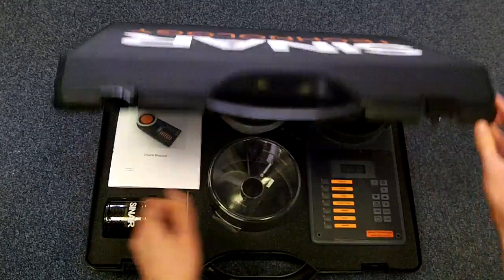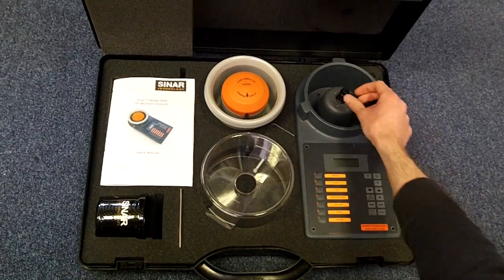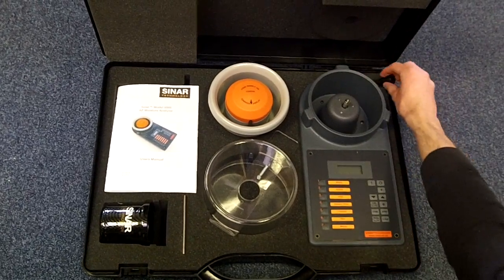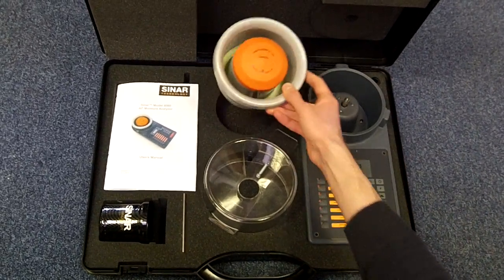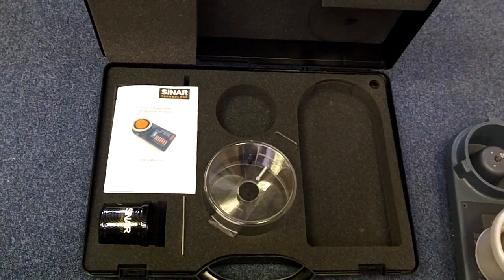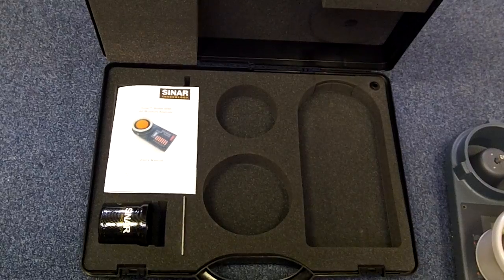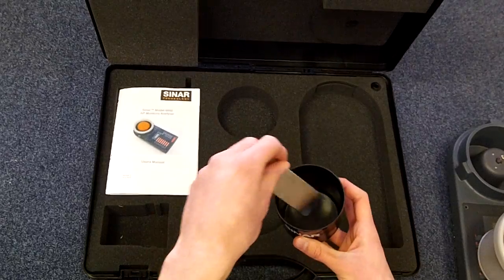Inside the carry case you'll find the main body of the instrument with a weight balance retainer. To remove this just unscrew it and place it in the hole provided. It also comes with the sample cell, the filling hopper for loading samples into the instrument, the measurement beaker and a strike-off blade for use with the beaker.